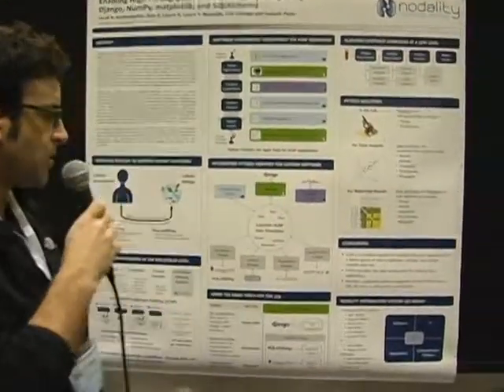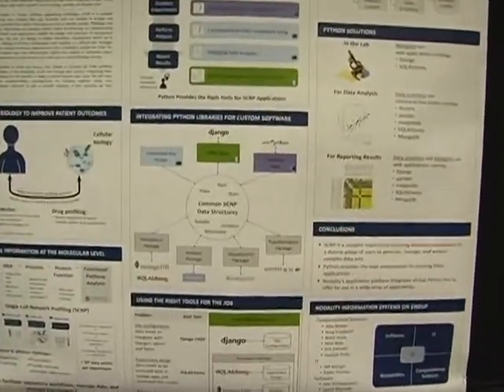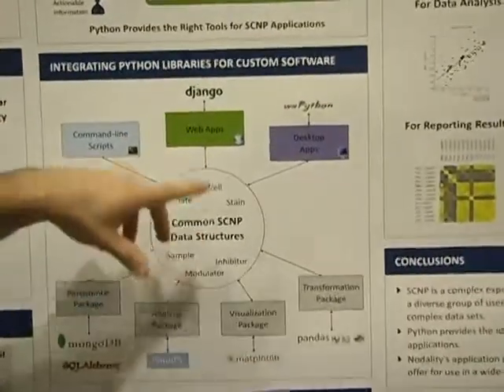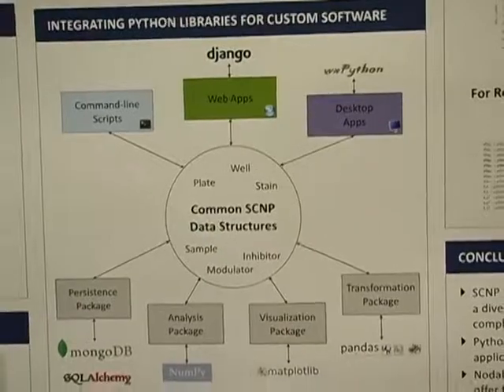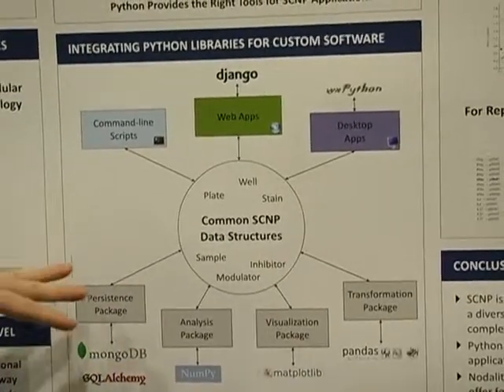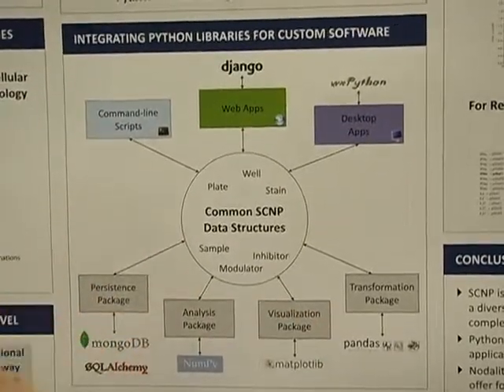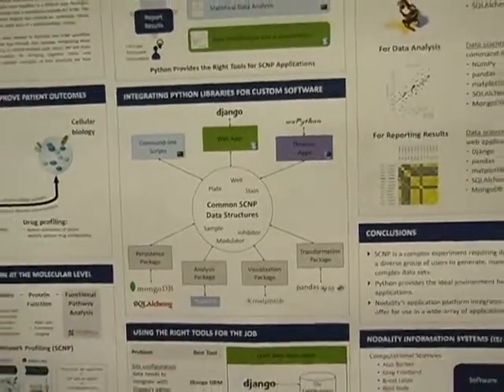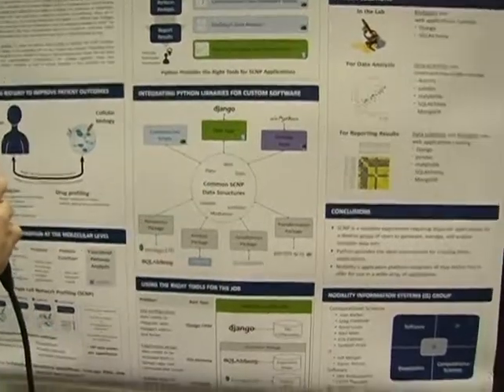This part of the poster describes a little bit about our object model. These are the apps which interface with the object model for different representations of the technology and the components of the technology we use. They access the different underlying stores, including database and disk access, through this layer. So we try to keep things modular.